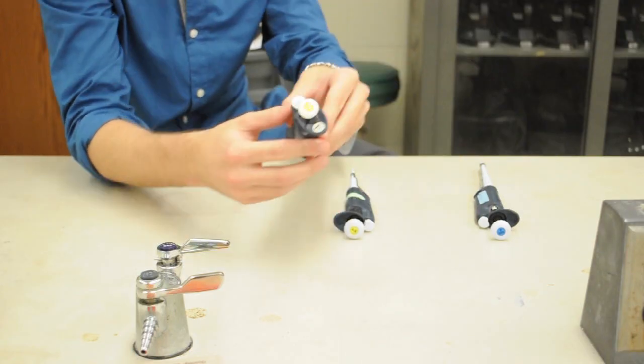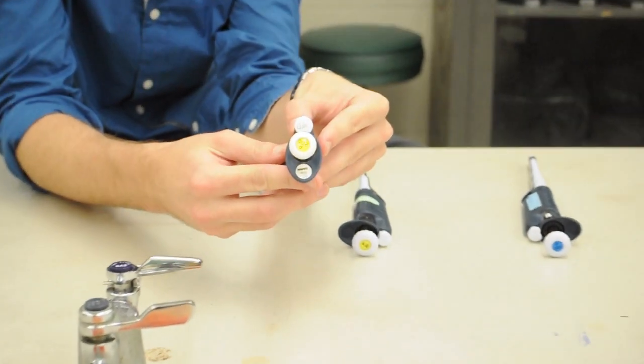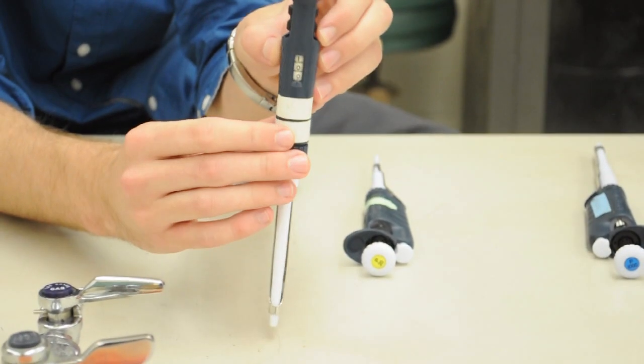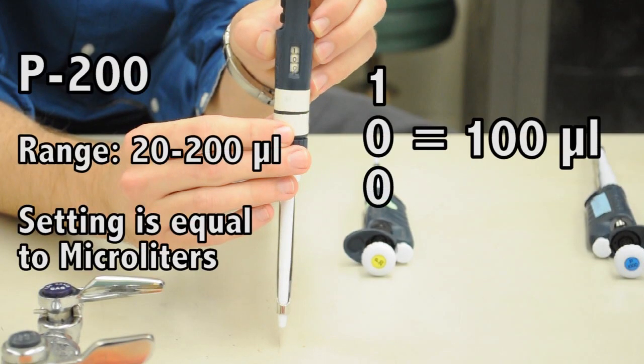For the P200, the effective range is 20 to 200 microliters. And the 3 digit number that you see correlates to the actual number of microliters that you'll be drawing and dispensing.